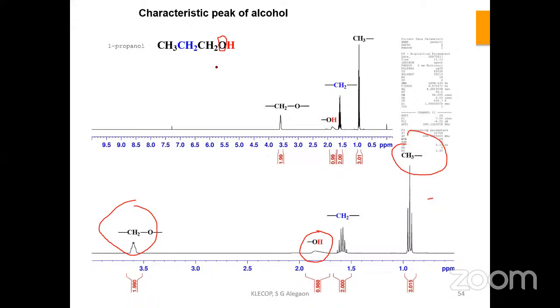At that time the carbon acts as electron deficient, and the hydrogen attached to that electron deficient carbon is neighboring it. Those hydrogens, those protons, we are going to observe de-shielded rather than shielded. So that's another important point one should know before going to structural elucidation: what is shielding and what is de-shielding?